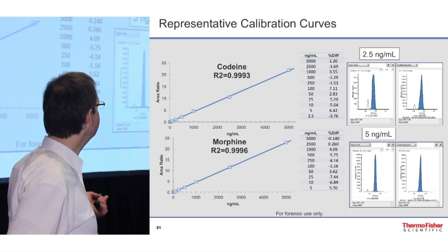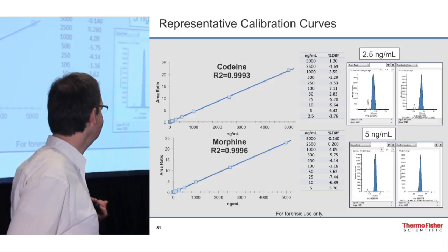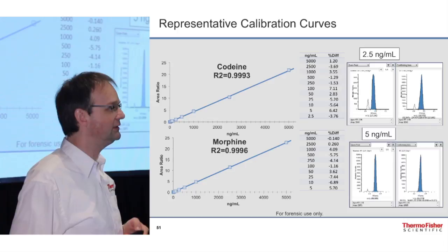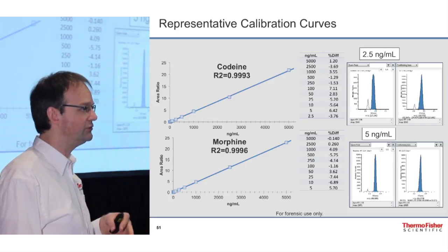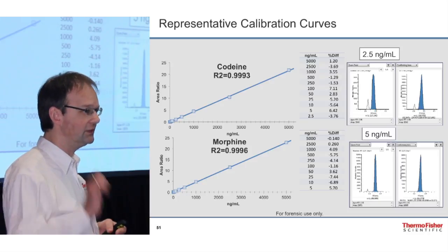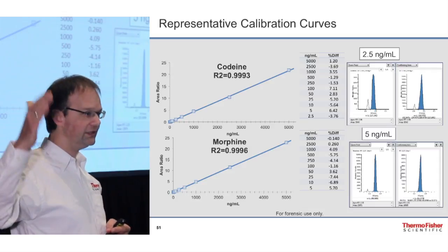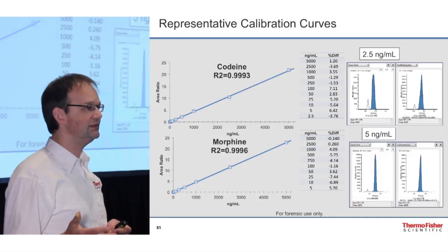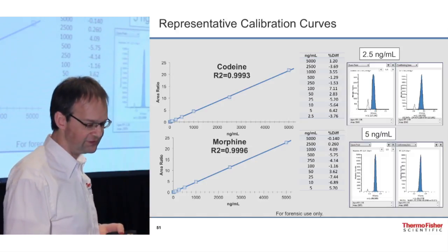And what we have as well, of course, valid for the other applications as well, but not yet mentioned, is that we can apply ion ratios. This is automatically done by TraceFinder as well. TraceFinder even can derive the ion ratios from a high concentrated standard. It's a one-click application for you to say, okay, just look into this standard file and get the ion ratios from there and apply it to the rest of the analysis. So that's easily done. You don't need to put it in. If you're dealing with 500 components, it could be very tedious. TraceFinder does that for you.